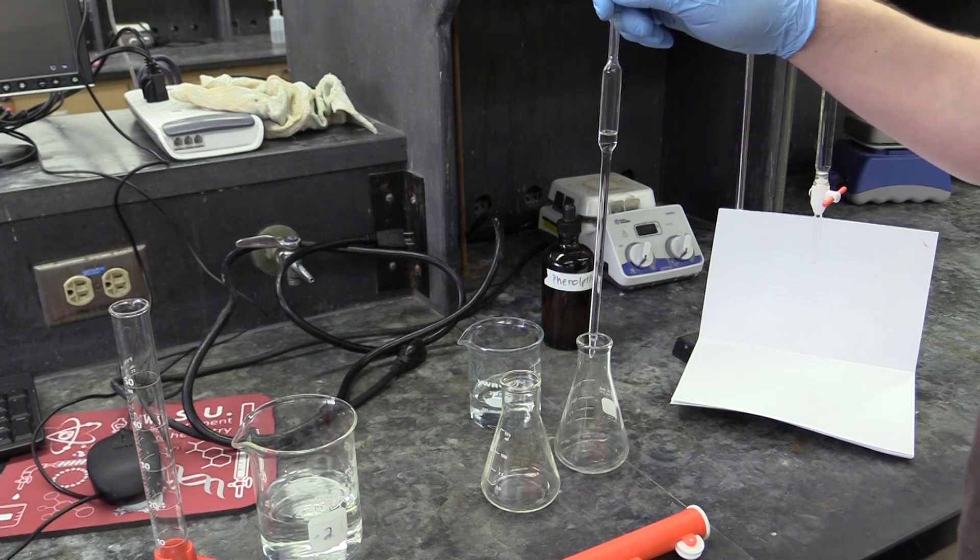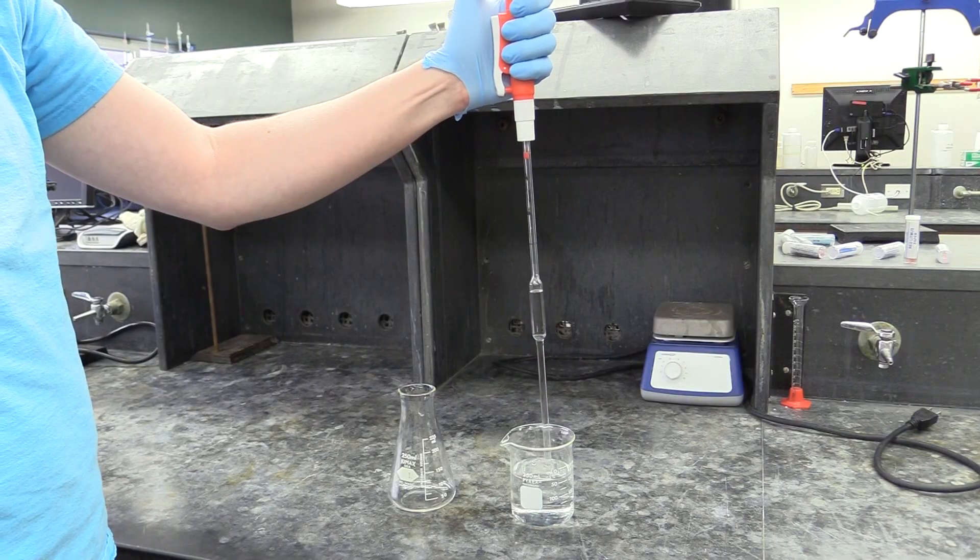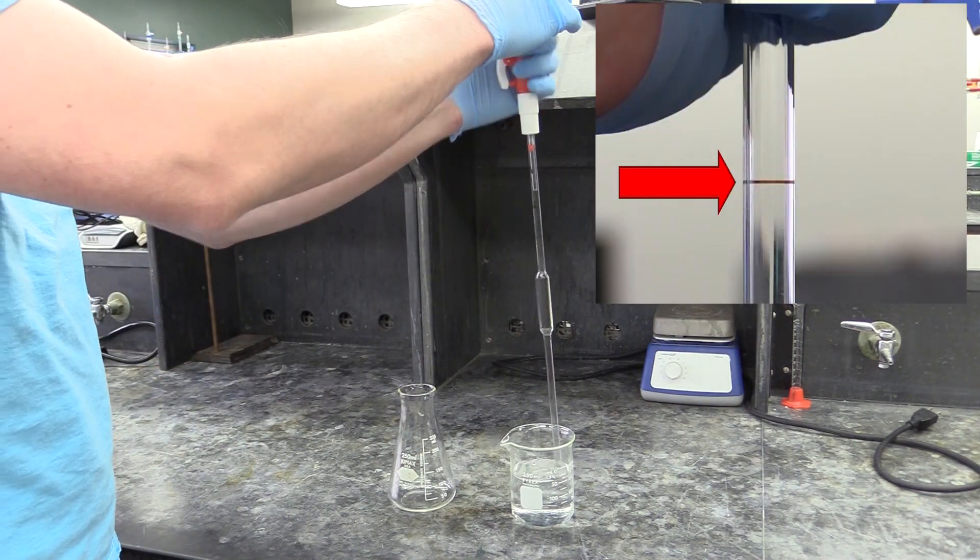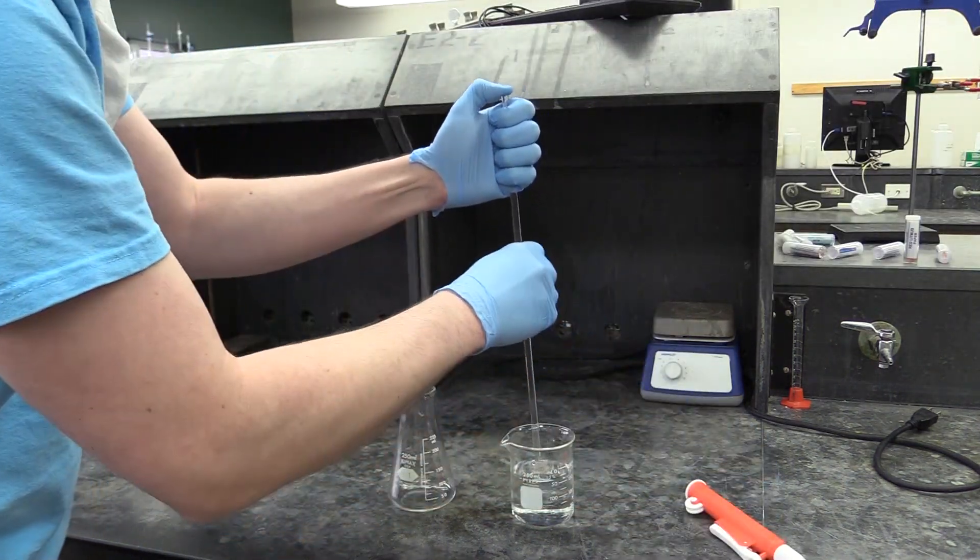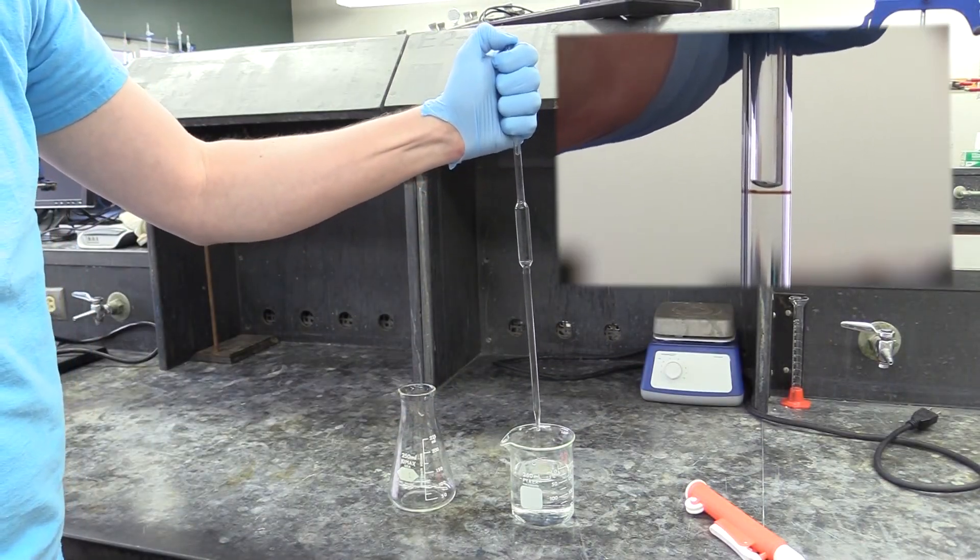In case you're unfamiliar with the volumetric pipette, here's a couple of tips for using one. To fill it, use your pump to slowly draw the liquid up to a point just past the index mark on the pipette. Then remove the pump and cover the top with your thumb or finger. Finish filling it by letting the liquid level drain until the meniscus is aligned with the pipette's index mark.